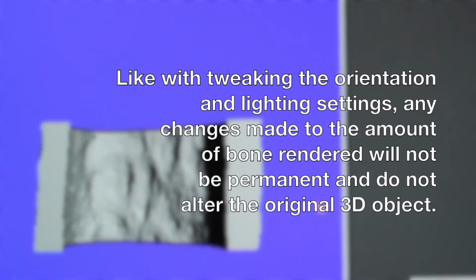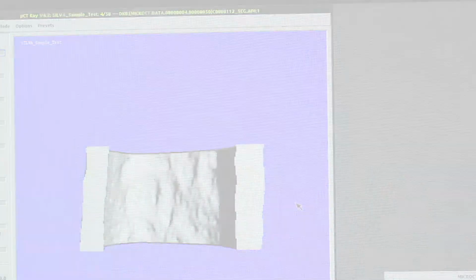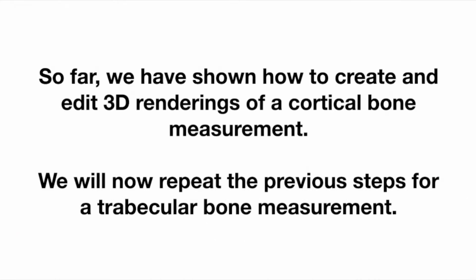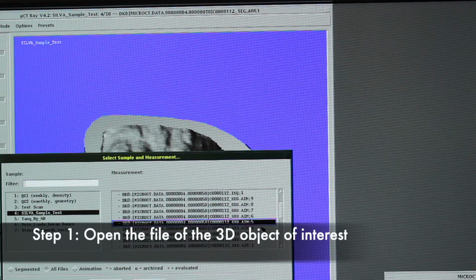Like with tweaking the orientation and lighting settings, any changes made to the amount of bone rendered will not be permanent and do not alter the original 3D object. So far, we have shown how to create and edit 3D renderings of cortical bone measurement. We will now repeat the previous steps for a trabecular bone measurement. For your convenience, we have listed the necessary steps, starting with the opening of the file of the 3D object of interest.